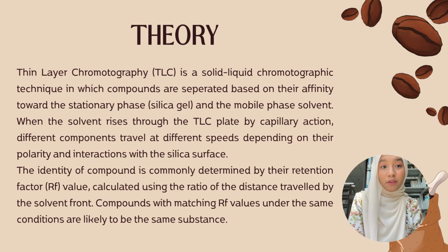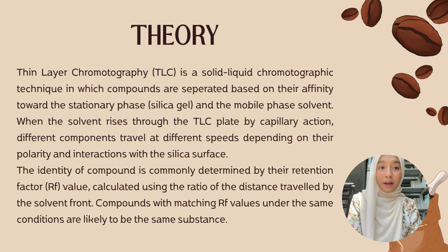The identity of a compound is commonly determined by its retention factor, RF value, calculated using the ratio of the distance traveled by the compound to the distance traveled by the solvent front. Compounds with matching RF values under the same conditions are likely to be the same substance.